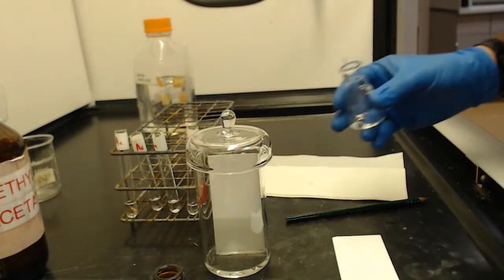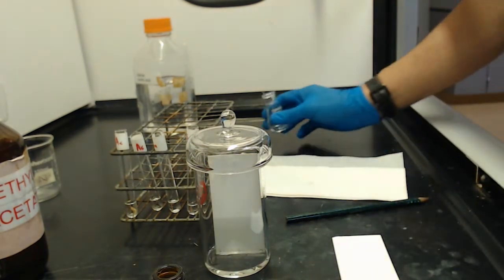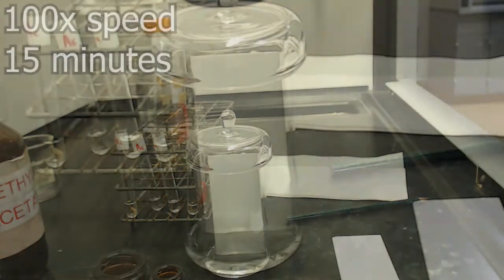We shouldn't need this anymore. I don't like to throw it away yet, just because I might need it again if I have to redo a plate or something. Just got to set it aside. I recommend you never toss anything out until you're done and you have all your data.